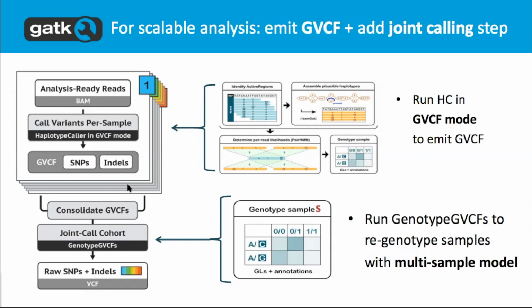And what do you mean by Phred scores? We have used some kind of normalized PL scores for those scores that are touched by this algorithm. Yeah, so we can calculate those PLs for the variant sites. Okay. We do actually, I didn't go into it, have a similar calculation for the non-variant sites. And we'll talk a little bit more in the next bit about that.